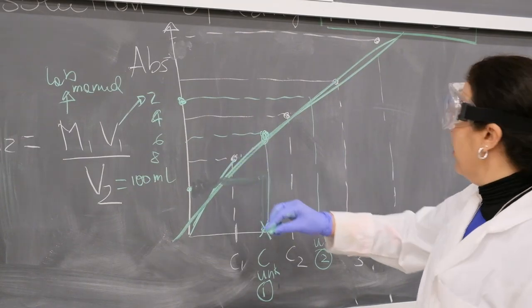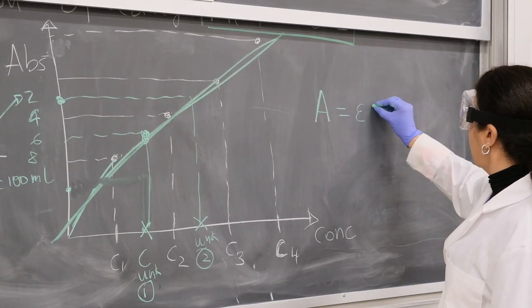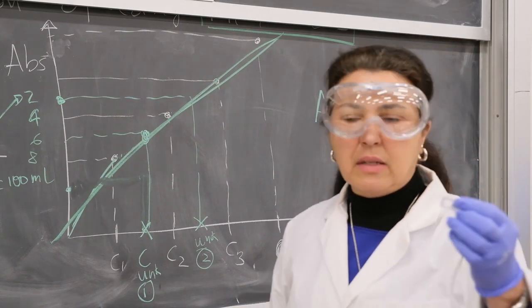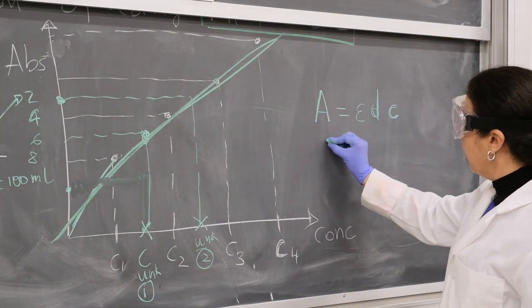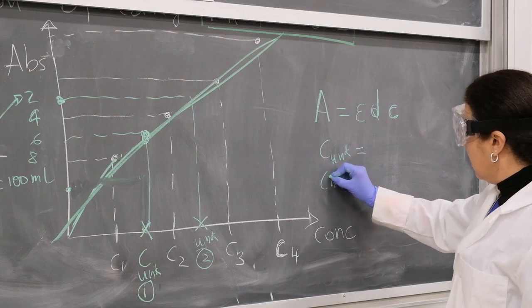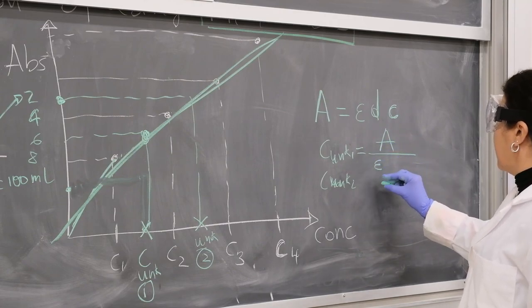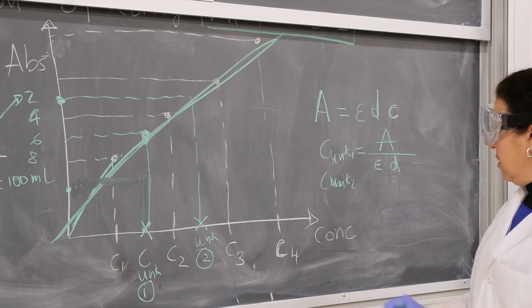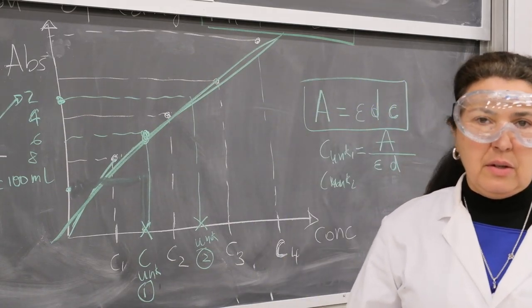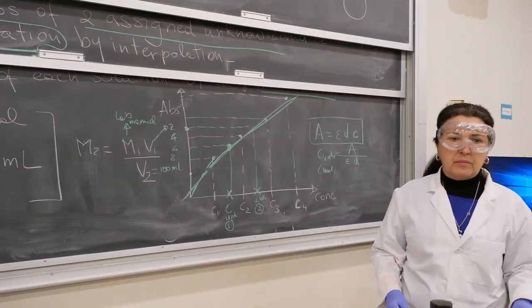So, and how are you going to do this? The absorbance is equal to the constant times the length of the cuvette, there's always 1 centimeter, times the concentration. So you will find C unknown 1 and C unknown 2 by dividing the absorbance by epsilon and d for both of them, okay? And this is the Lambert-Beer law that is discussed in your lab manual. Once you find the two concentrations, you're done. Any question about this?